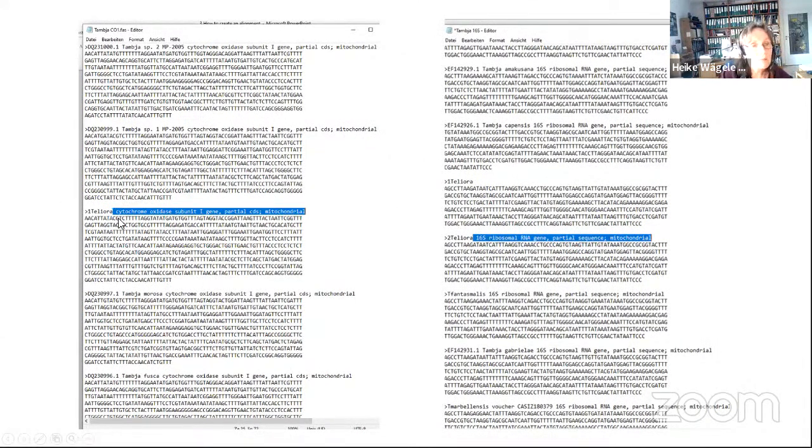So here, for example, I renamed this already, this sequence: 1, T for Tambia, Eliora is the species name. I did this already. I actually erased the rest, because if you keep this in there in some way it's united, then this name would differ from this name. So I erased everything and have here only 1 T Eliora.